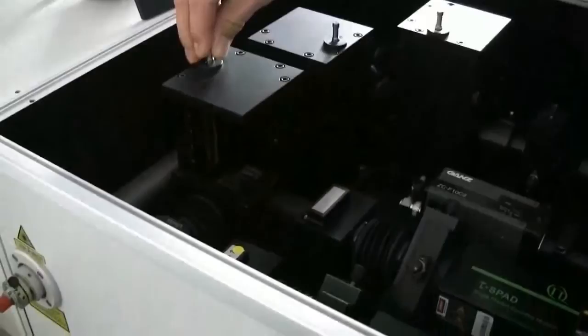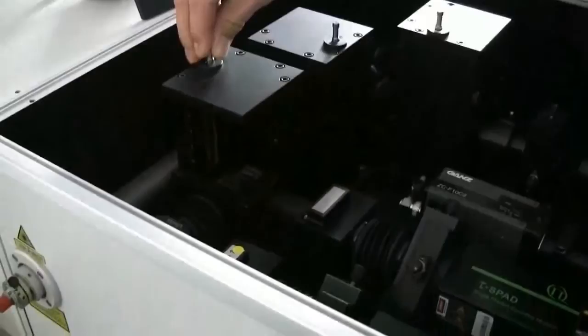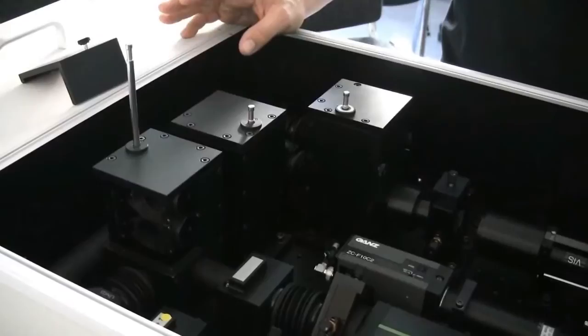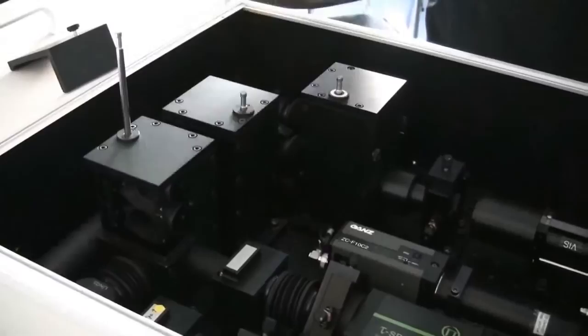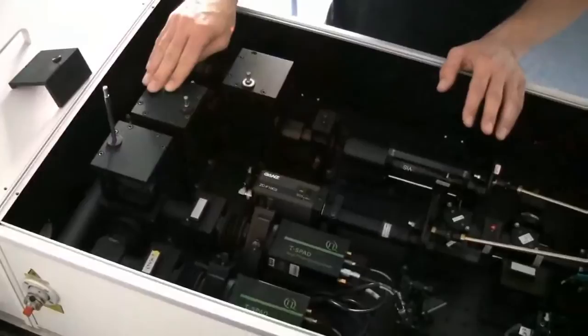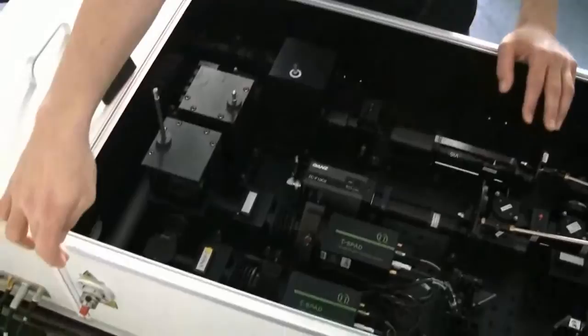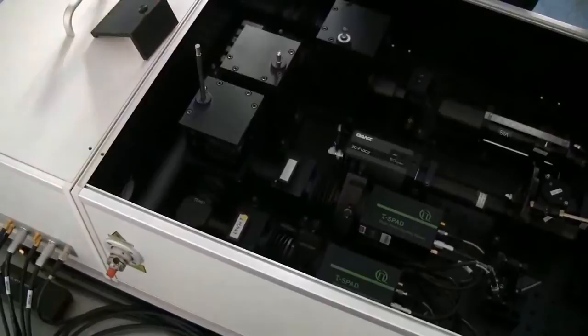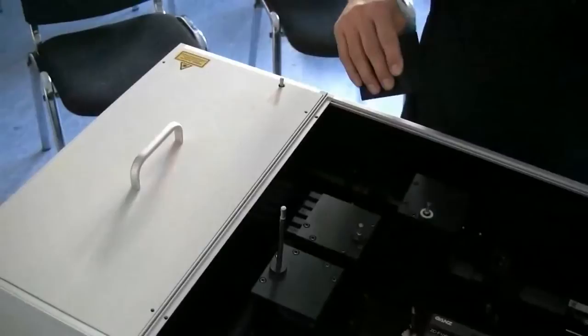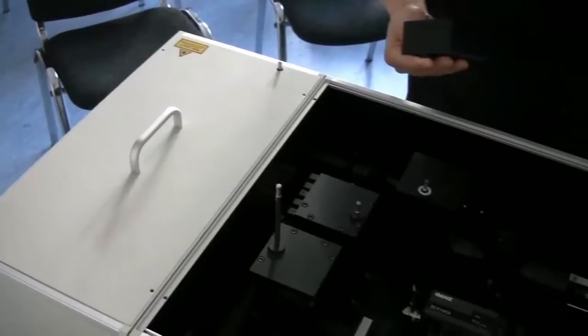In this position we have mounted a mirror, and here a polarizing beam splitter. Those filter cubes can also contain dichroic beam splitters in order to measure FRET — so you can see the acceptor channel in one detector and the donor channel in the other detector. This is of course modular. In the simplest case you would just have this tower to switch the emission between detector 1 and detector 2. This second tower is responsible for directing the light to the exit port where you can connect a spectrometer, or whatever other detector you might like. This tower directs the light either to the first two detectors or to the detector extension box, which can house a couple of PMTs in case you want to do measurements in the UV range.